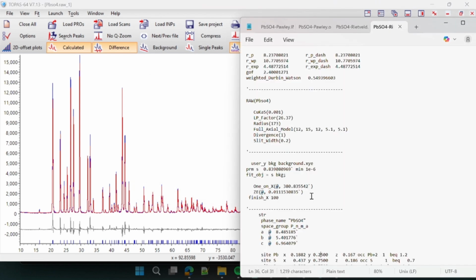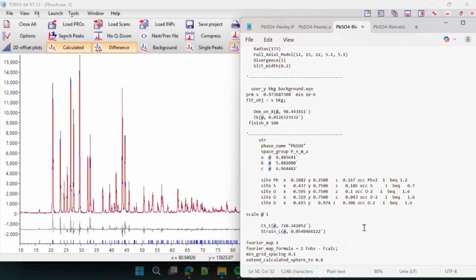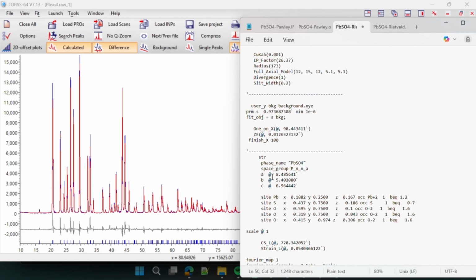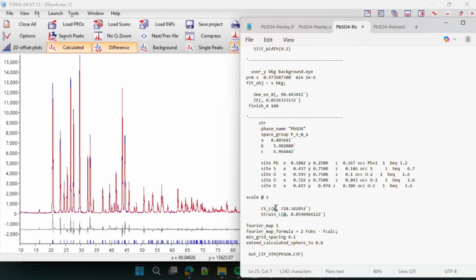Interesting, it didn't open. Okay, I'll fix this in a minute. Easy mistake to make. So I was editing the output file instead of the input file. This happens a lot. So we'll paste that in again, and we'll take off these. And leave the scale on.